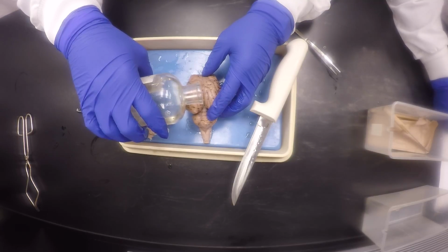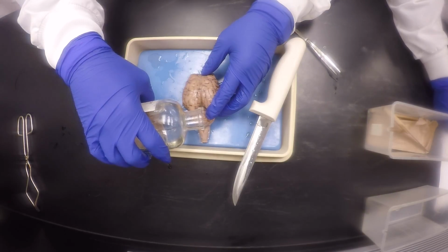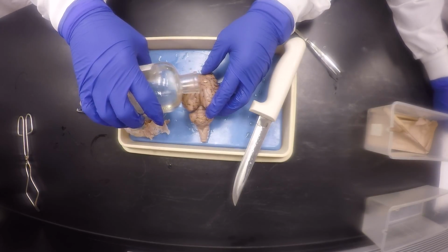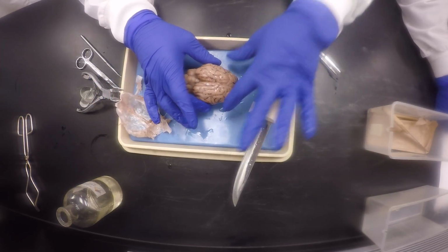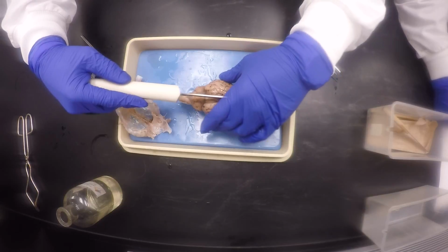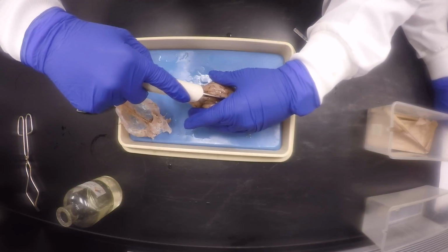I don't want to pour the whole bottle on it. That's why it's going like that. Oh crap! I got relatively nice little drops. Make sure you hold it straight so that it cuts down, and then you put your knife below, like that. So you're gonna have to put your knife forward like that, and then you're gonna have to.